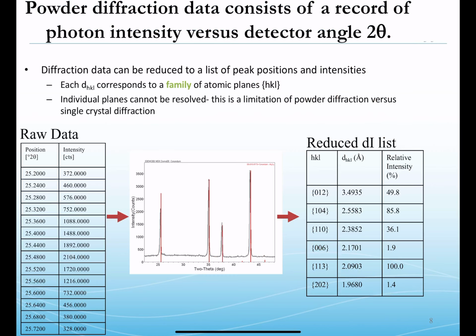Okay, so in other words, here's how the process might go. We'll collect a set of intensities, so we'll monitor data, and until Bragg's law is satisfied, there'll be no intensity of detected light at a certain 2 theta value, again, where the incident beam would be relative to where the detector is. Okay, so 2 theta is here.